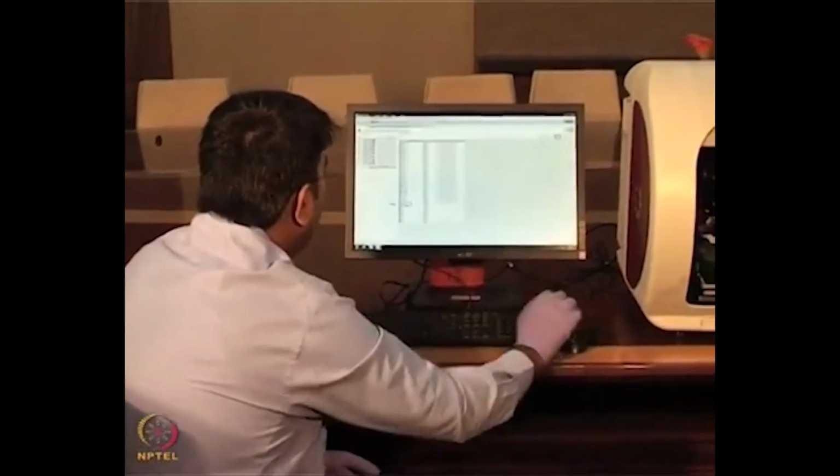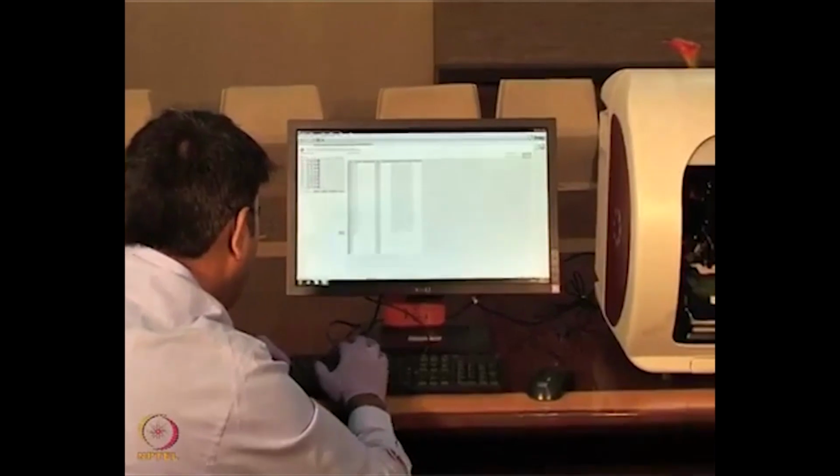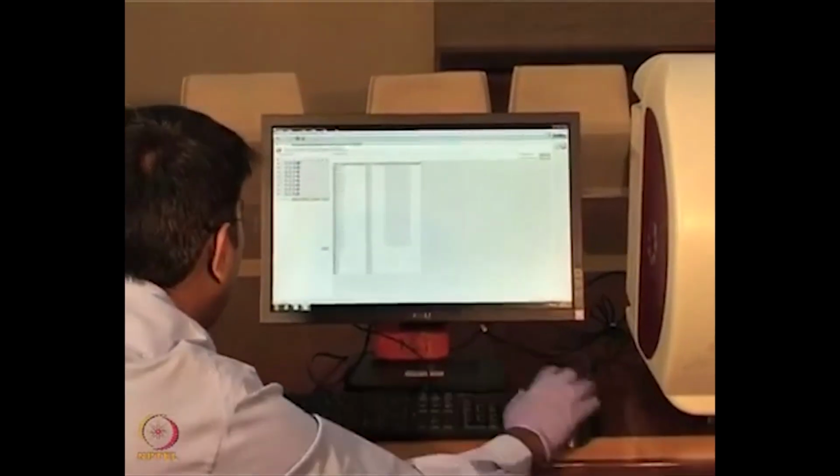Here I am mentioning the mouse monoclonal antibody, which I will enter as mouse IgG. I am using 25 micrograms per ml, and the molecular weight of the mouse monoclonal antibody is 150 kilodalton. It automatically calculates 166.7 nanomolar. I will just copy this one.